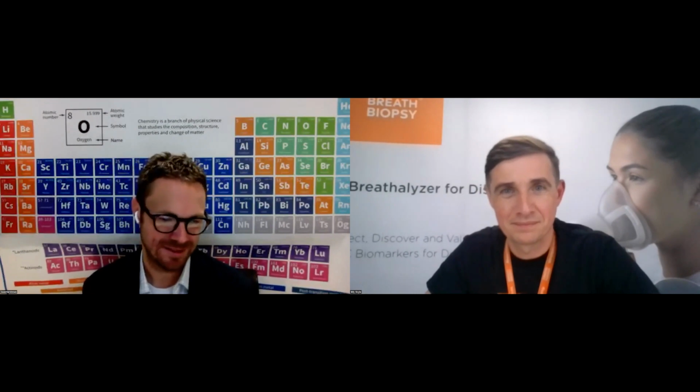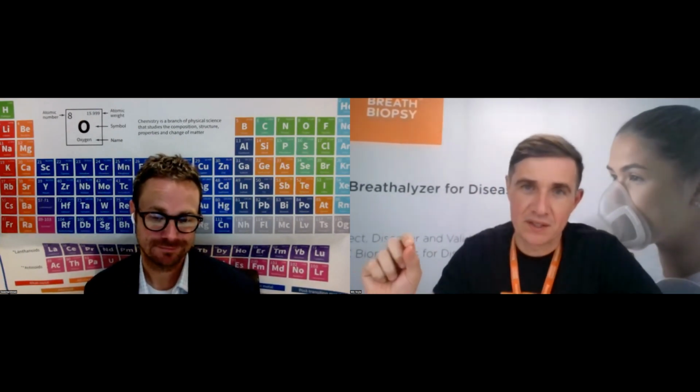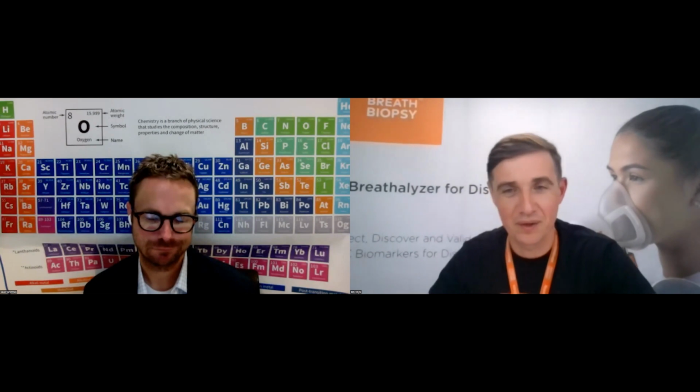I was wondering if you had any thoughts on whether or not that would be useful to the breath field. I mean, it could be. It depends. Again, you do what you need to do to be able to sample properly within the constraints of your individual. And so I could envision a scenario where that might be useful. We've just never explored it, so I'm not truly sure. Yeah, we've done a little bit of work, but only in the context of very targeted analysis, where you're looking for a single isotopically labeled compound. So yeah, you don't care about anything else necessarily in the background.